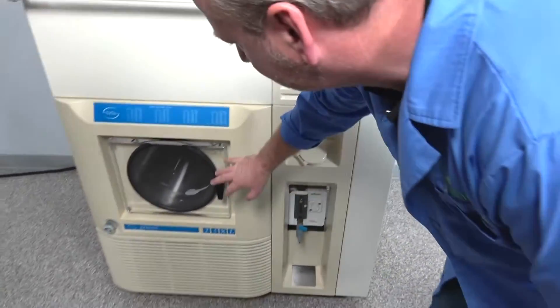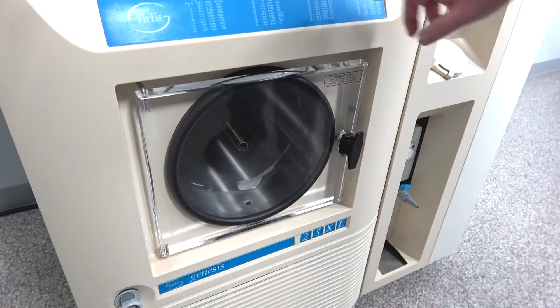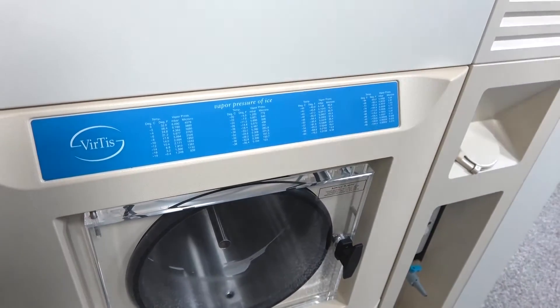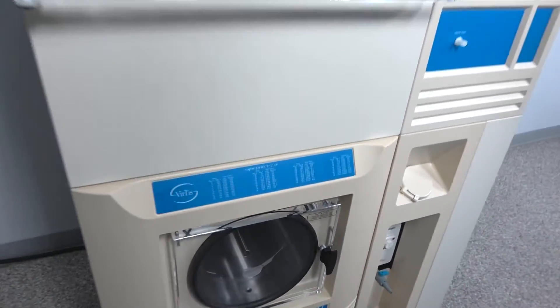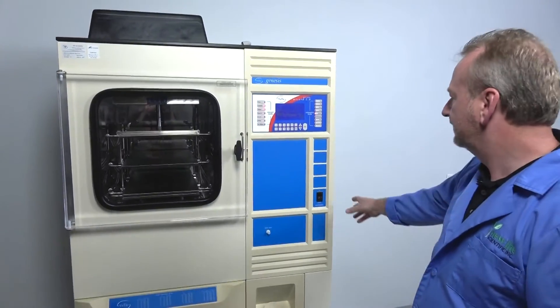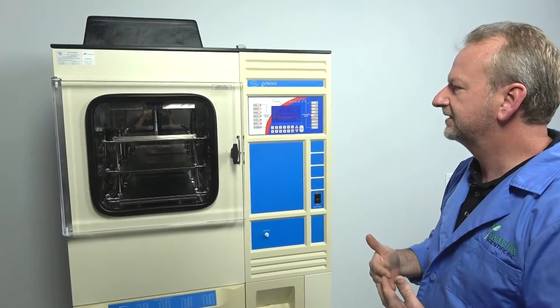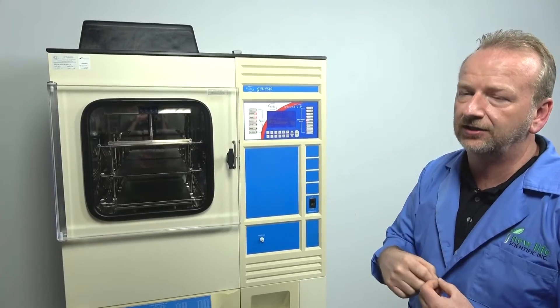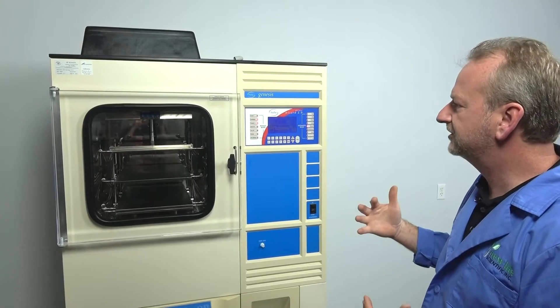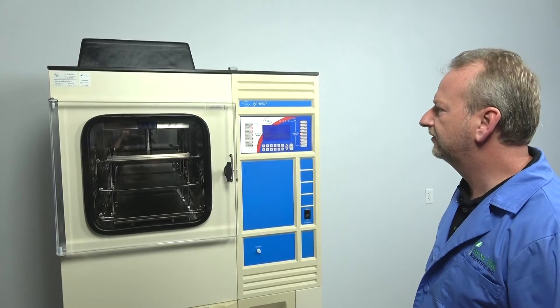You can see how nice the door and everything on this machine is kept. It's really nice to have the vapor pressure of ice chart right there — a quick-check diagram they've incorporated. It does have the hydraulic system for the stoppering tray, and unlike some Genesis models that require compressed air to be plugged in, this is a one-package deal — just plug it in and it has everything you need to get the job done.